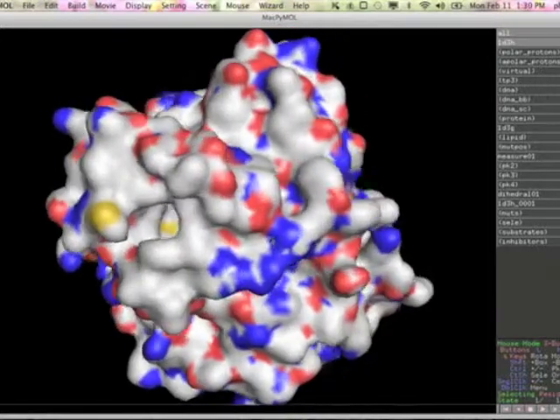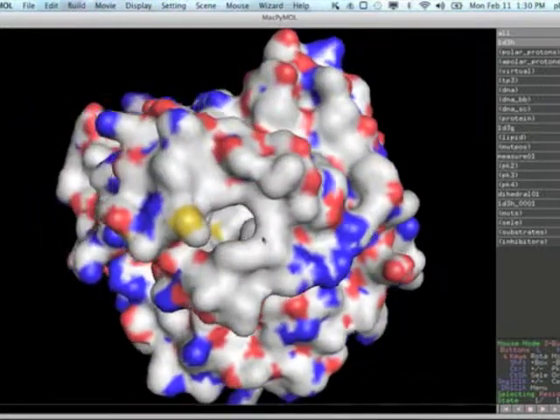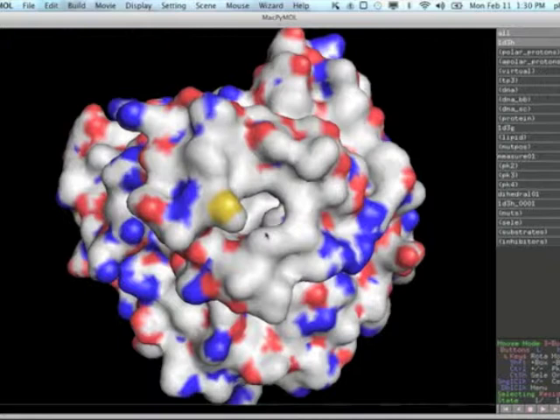One other thing that's important about this enzyme is that it's an enzyme, so it operates on small molecules, on ligands, and we can actually show them too. This is the fun thing about going into a protein structure, trying to see all the different moving parts. So let's show these cofactors, or ligands, as sticks. These would be the things that the enzyme is operating on, and of course they're kind of hidden away inside the protein.